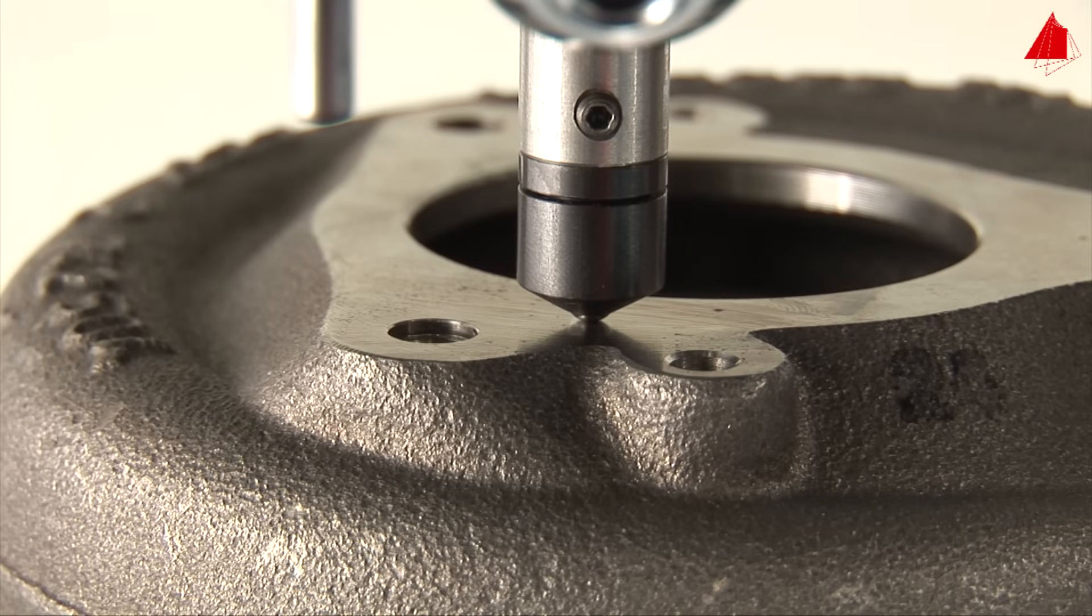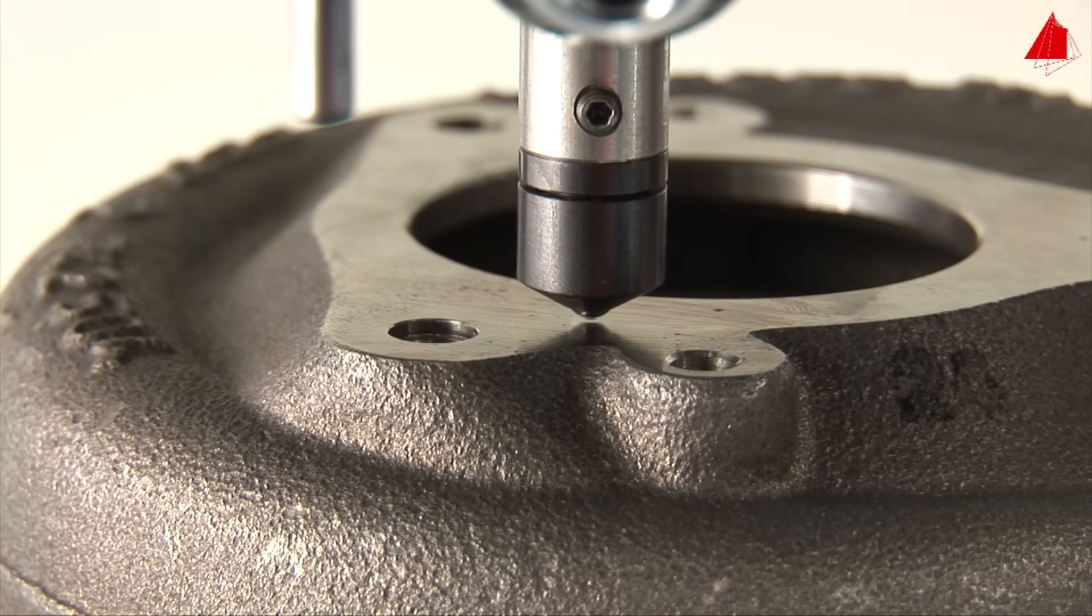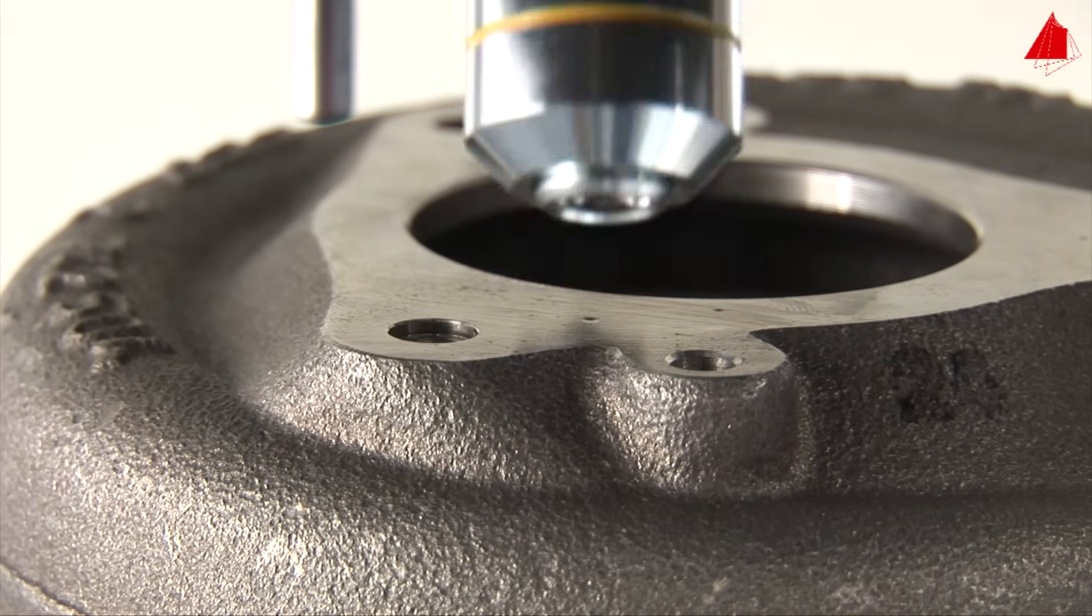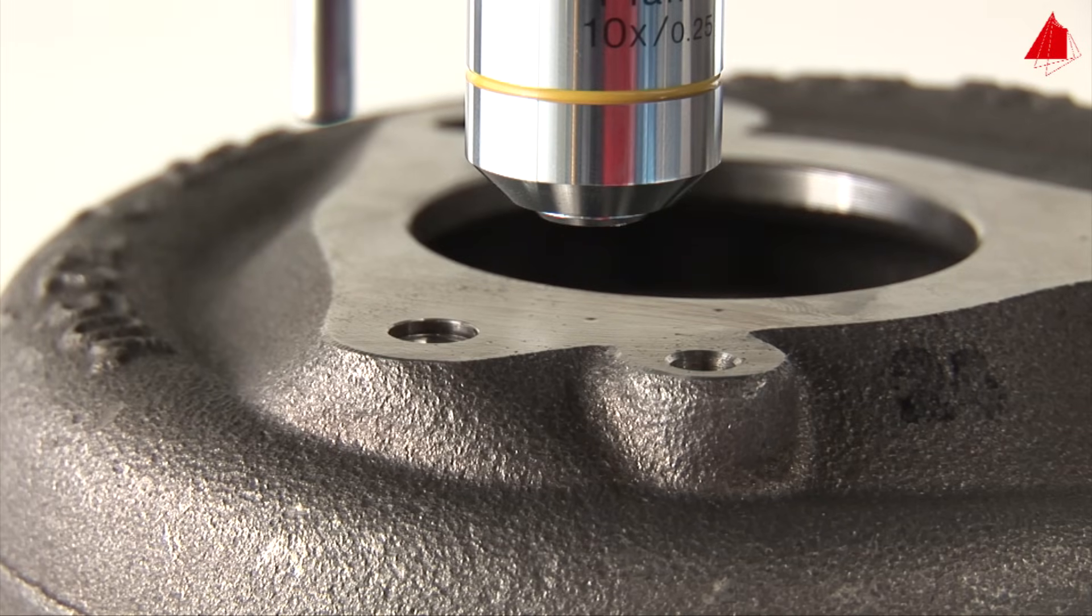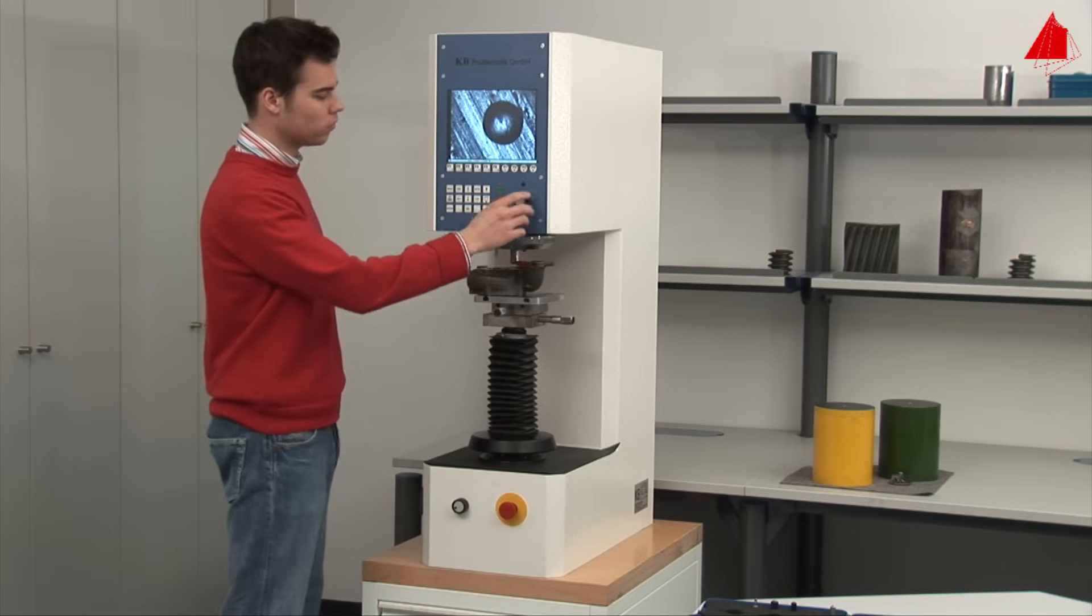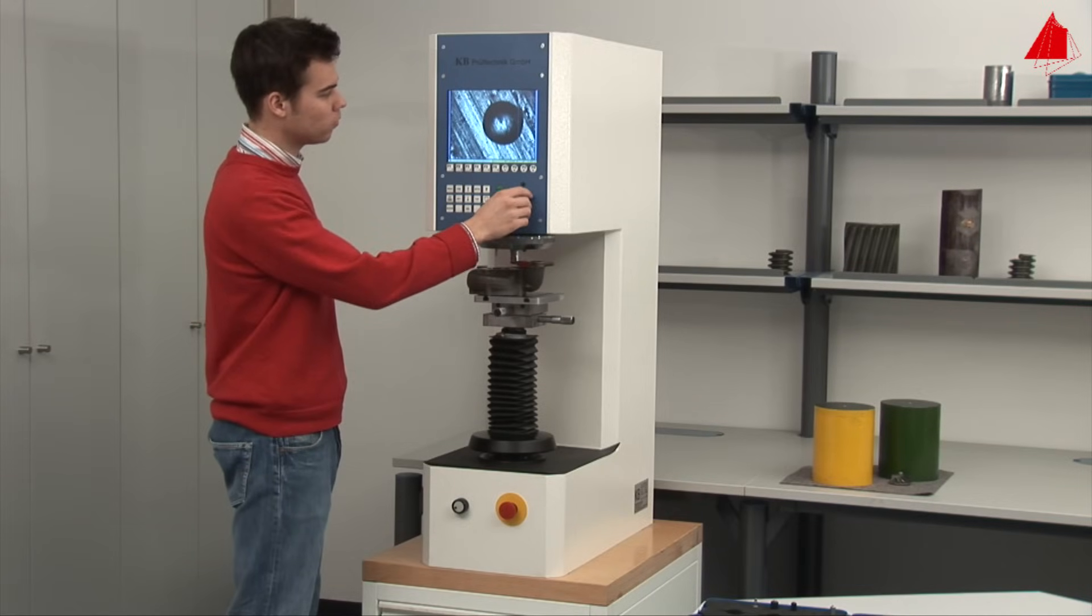After maintaining the test force for a certain time, the indenter automatically lifts off again and the microscope lens pans back to its former position. The indentation can now clearly be seen on the monitor.